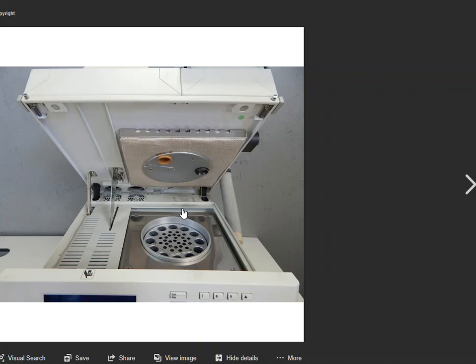So that is why these temperature parameters and these time parameters are very important for you to enter in, because it can be smart enough to be processing other samples in preparation of the next runs that will happen on the GC instrument.